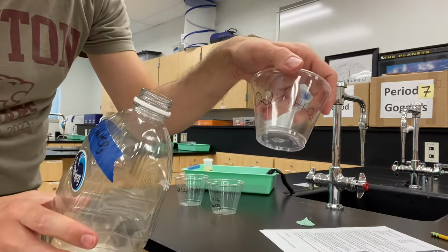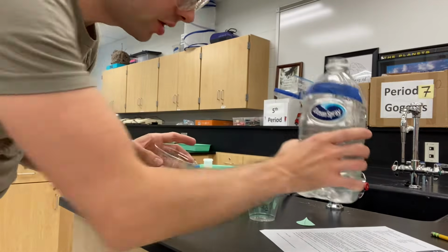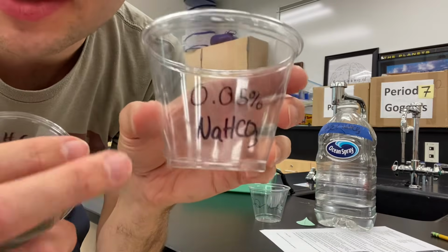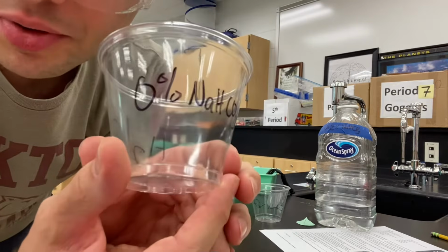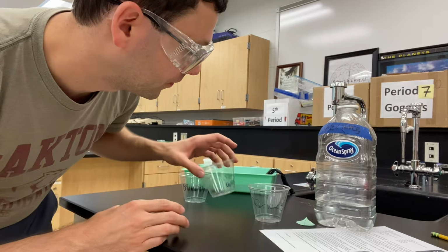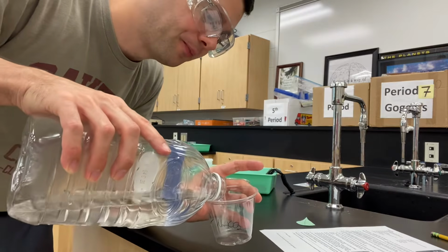The first thing you are going to do is pour the sodium bicarbonate into your cups. You've got 3 plastic cups. You might not be pouring this into every cup. For instance, if you are manipulating bicarbonate concentration, you can see that these will end up having 0.05, and then we'll also have a 0% sodium bicarbonate. So you have to pay attention to your individual experimental conditions. But assuming you are going to use all 0.2% bicarbonate, go ahead and add it to all your cups.